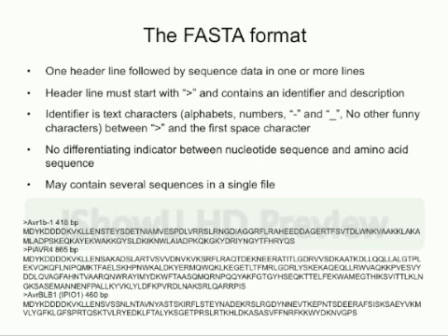I would like to go a little bit into the Unix side of bioinformatics on the Mac. Before I do, I would like to mention that all our sequences are based on this format, the FASTA format. It's a very simple format to represent your sequence, and it doesn't matter whether it is a protein or DNA sequence. The identification line has a greater than sign in front, on one line. Anything between the greater than sign and the first space is the ID of the sequence, and the rest, from the first space until the end of the line, is called the description line.